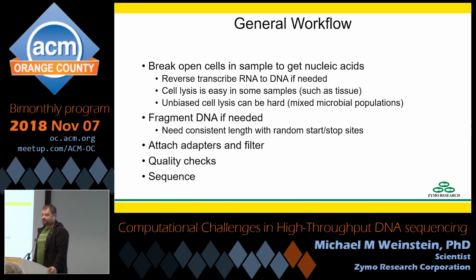So what is the general workflow for dealing with sequencing? Pretty much in all circumstances, you're going to start off by wanting to break your cells open. In the case of dealing with RNA, you're going to probably reverse transcribe it to DNA to make it a little bit more stable, but that can vary. In some samples, cell lysis, or the actual process of popping the cells open, is really easy. So mammalian tissue, for example, is super easy to break the cells open.